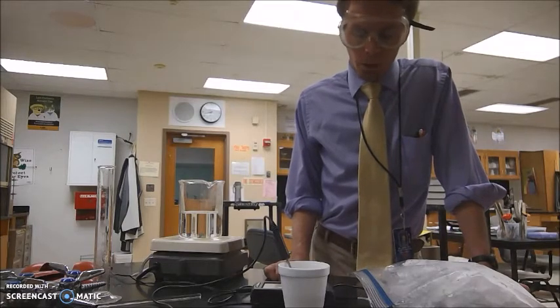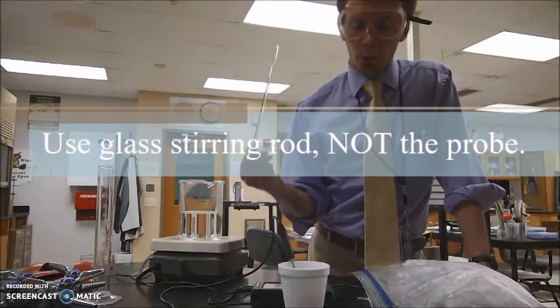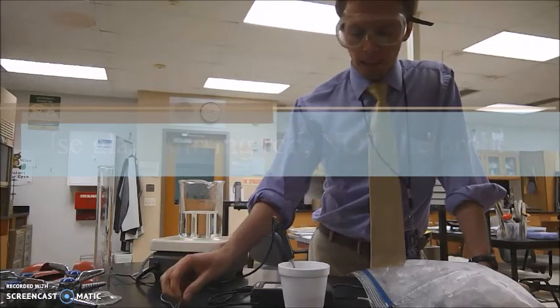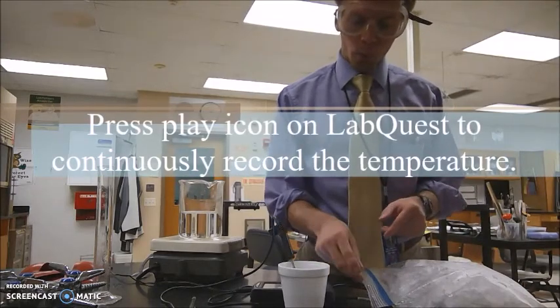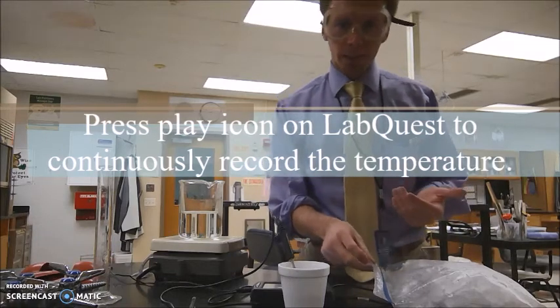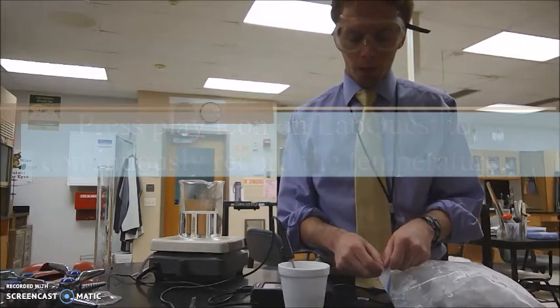A couple notes here. We're going to be adding ice and stirring it. I'm going to give you a glass stirring rod to use. Use that instead of the probe. The probe is sensitive and can break easily. Secondly, you're going to press the play button to get the probe to record temperatures over time. It'll be easier to see the temperature level off, which is our ultimate goal here. If you have questions about that, your instructor will show you how to do it.